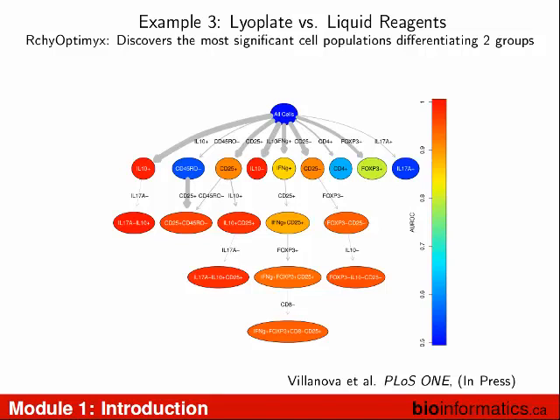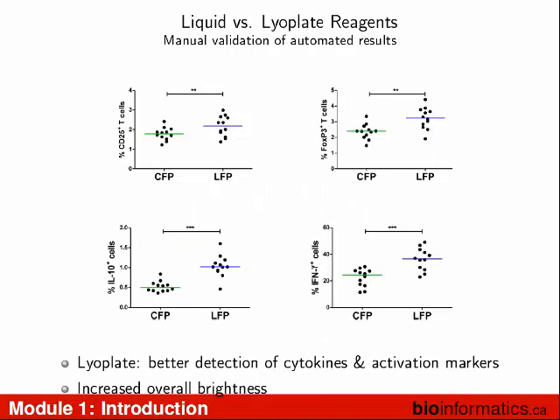Well, I'm trying to think, because some of the stuff is, so where does statistics end? It's math and stats, where you draw that line. So when we're making diagnoses or doing discovery, all this is based on p-values. So this is essentially a p-value plot. And all this stuff is based on statistics in the sense that we had to come up with some cutoffs, some thresholds that allowed us to make that separation between group one and group two.